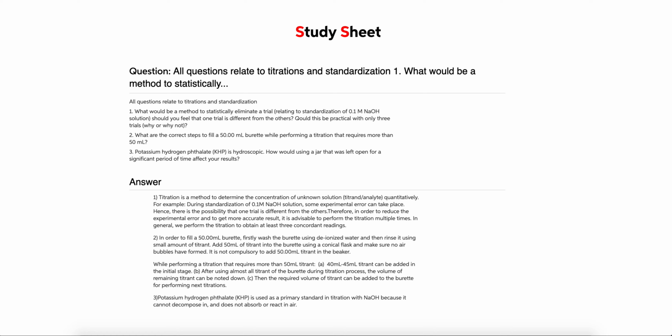Potassium hydrogen phthalate, KHP, is hygroscopic. How would using a jar that was left open for a significant period of time affect your results?